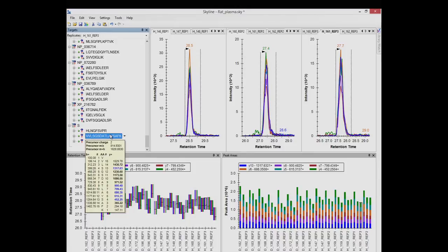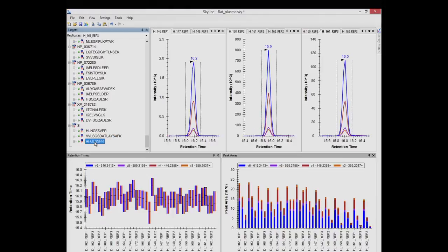So in this case, these 3 peptides are all injected into the sample at a constant concentration. Their total intent is to catch this sort of decline. Okay, let's look at the last one and figure out whether it would be a good normalization peptide.